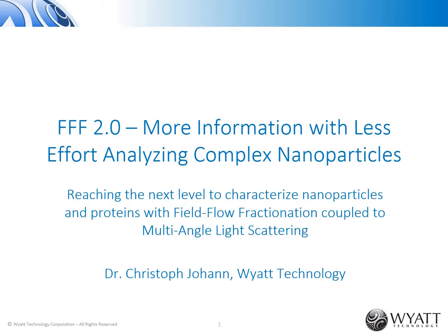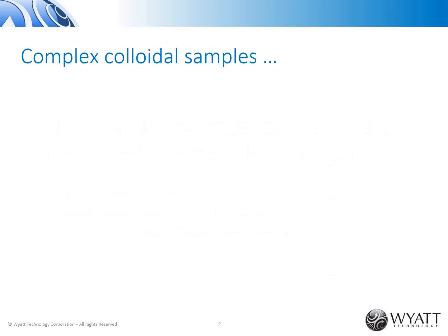Before we go on discussing FFF, let's first define what we mean by a complex sample. What is a complex sample in our context? A sample which is not homogeneous, but consists of various components with different sizes and properties, at least one being a nanoparticle.